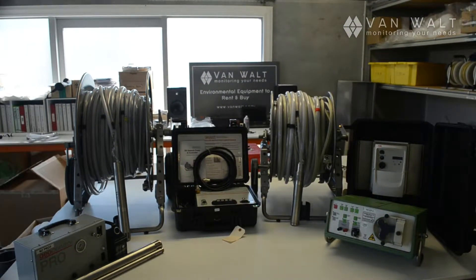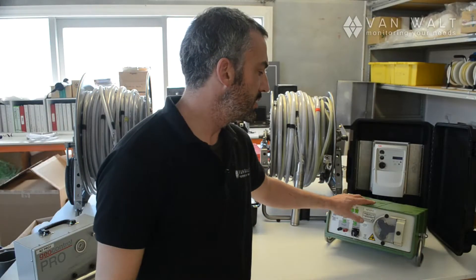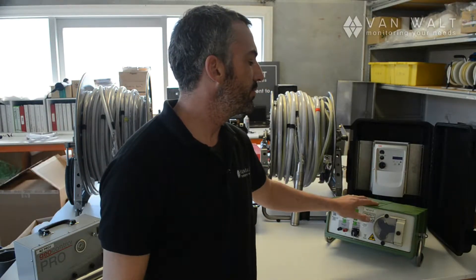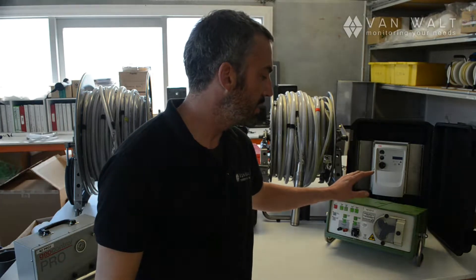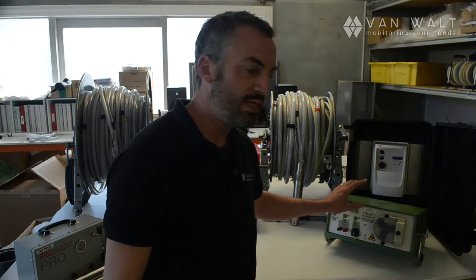This is a comparison video for the pumps that VanWalt favours, starting with the little peristaltic pump. This is a low flow sampling pump with a flow rate capability of between 0 and 2.2 litres per minute.